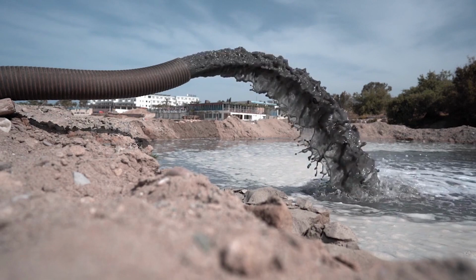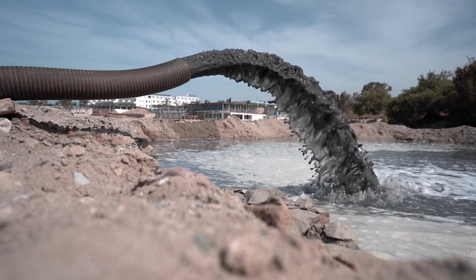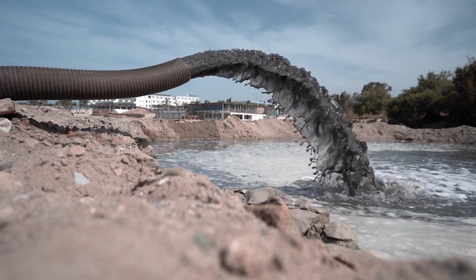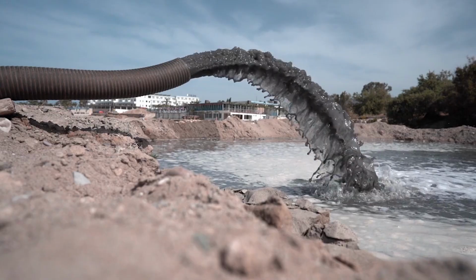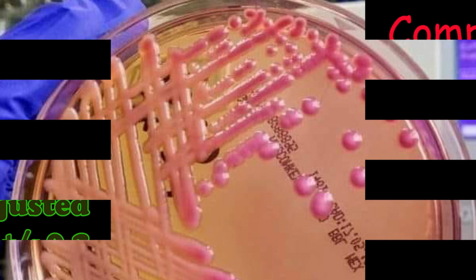He developed this medium for the growth of only gram-negative, non-fastidious organisms and to identify bacteria by lactose fermentation for his work. Bile salts and crystal violet make the MacConkey agar a selective medium. Lactose and neutral red make the MacConkey agar a differential medium.